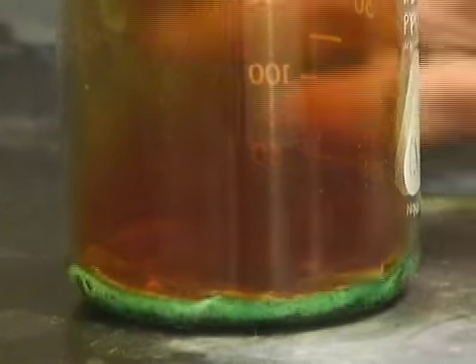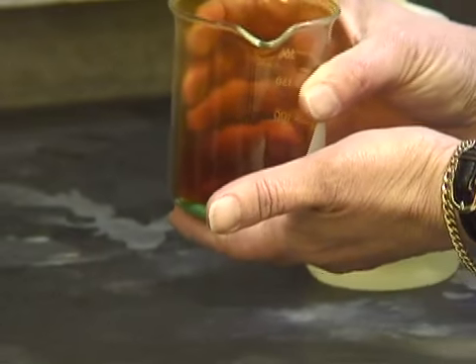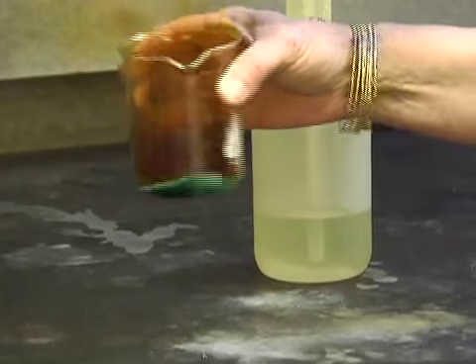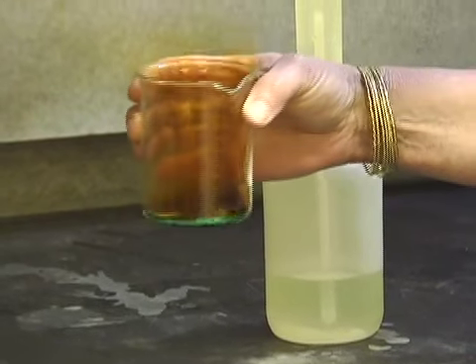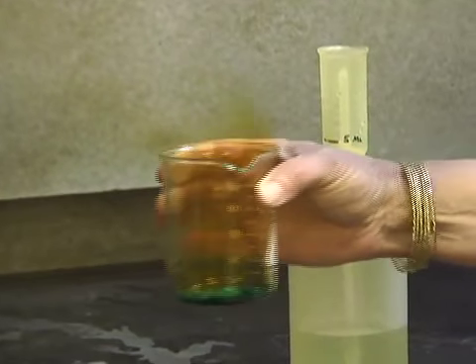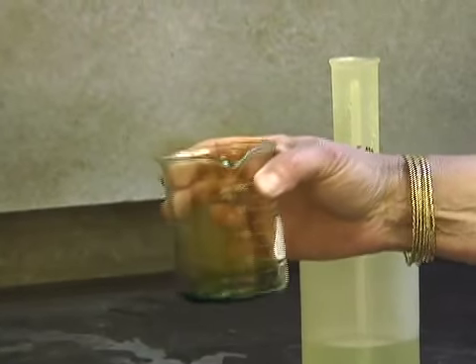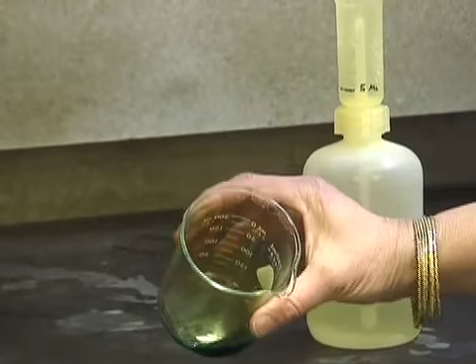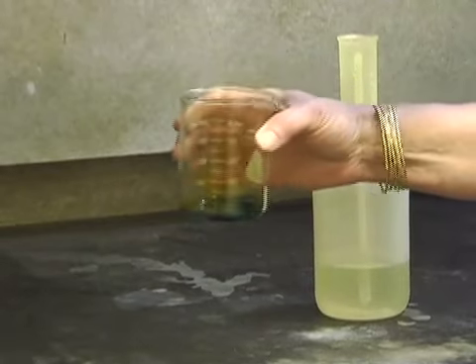The reaction is quite vigorous, and when I feel the bottom of it, it's getting hot. The bottom of the beaker, this reaction is hot. And I see a brown gas coming off of the copper as it's dissolving into that concentrated nitric acid. I am going to swirl it to enhance the speed of the reaction, and you can see that all of it has dissolved now.